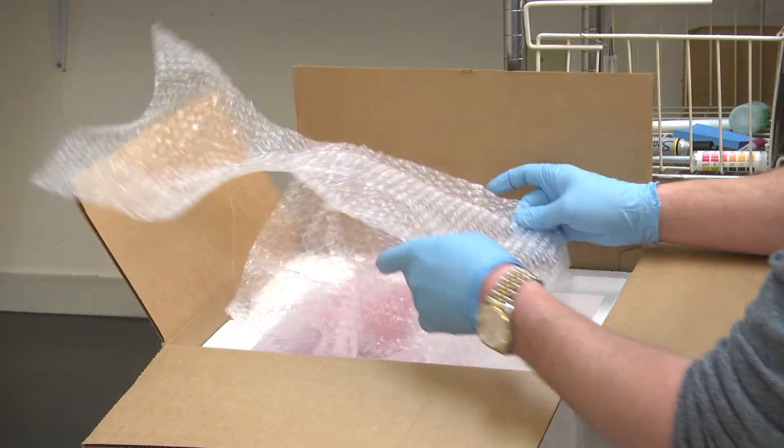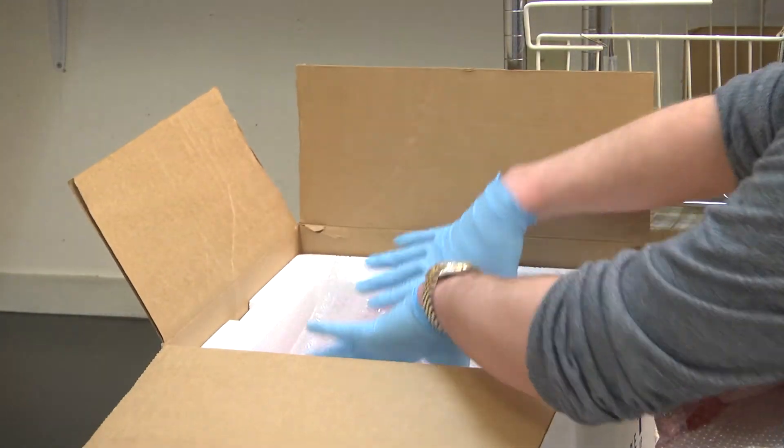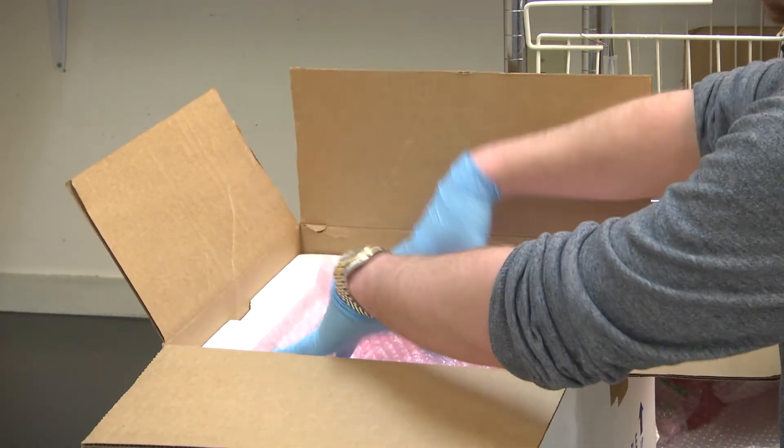Once samples are packed and cooled, make certain that the top of the cooler is sufficiently packed to prevent movement of bottles should the cooler be inverted.